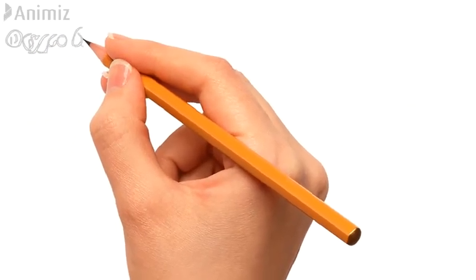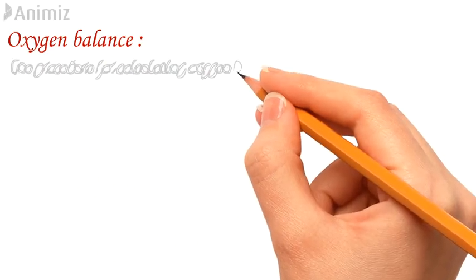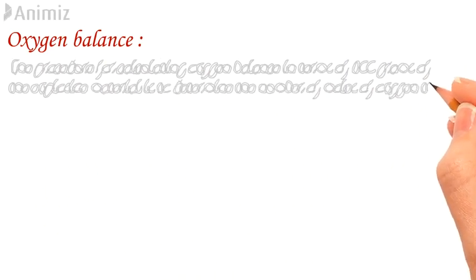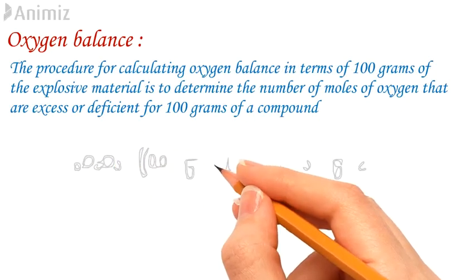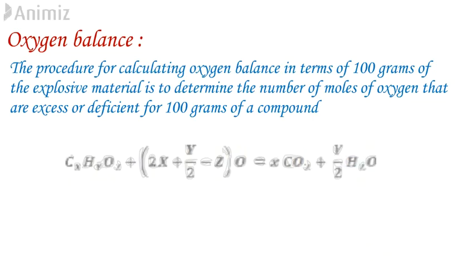Determination of explosivity theoretically: oxygen balance. It is an expression that is used to indicate the degree to which an explosive can be oxidized. If an explosive molecule contains just enough oxygen to form carbon dioxide from carbon, water from hydrogen atoms, all of its sulfur oxide from sulfur and all the metal oxide from metal with no excess, the molecule is said to have a zero oxygen balance.